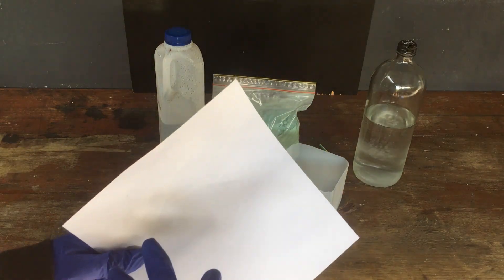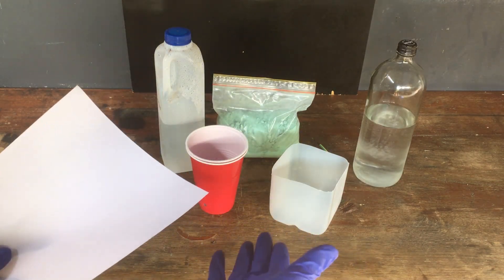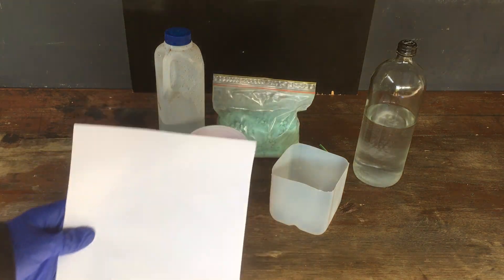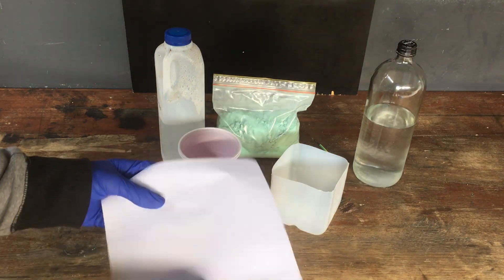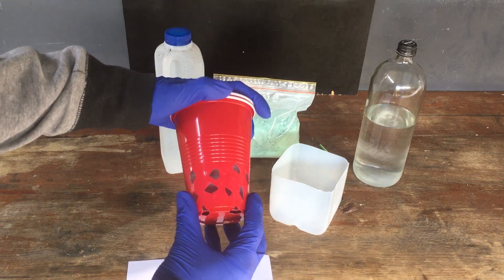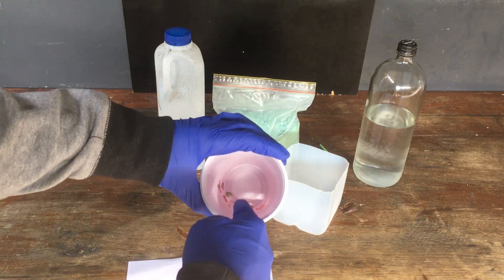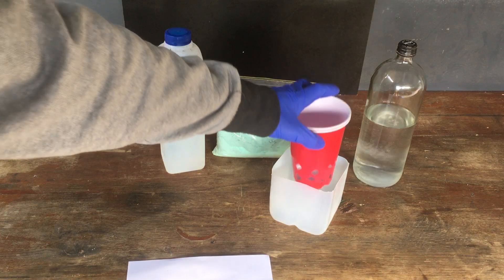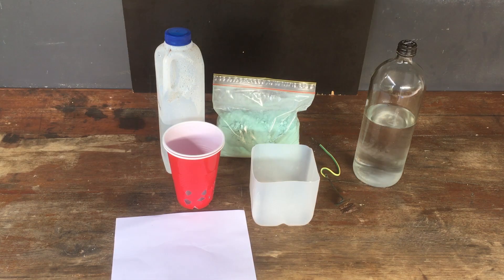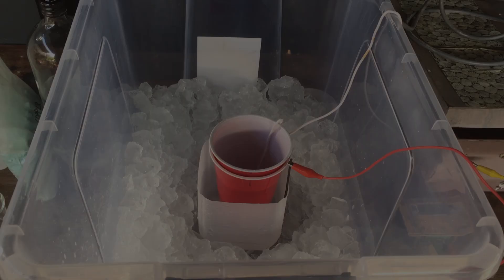This will pretty effectively separate the anode and cathode. I would be using a clay pot, but we're doing this reaction on a pretty small scale and I don't actually have a clay pot small enough. Paper is known to work, so we're just going to go with that. All we're going to do is wedge this piece of paper in between two of these plastic cups — I've put a few small holes in them so that current can pass through. Inside the cup will be our cathode compartment, and outside the cup in the bottom of the milk bottle will be the anode compartment. So I'll put the cell together and then we will get to preparing our reagents.